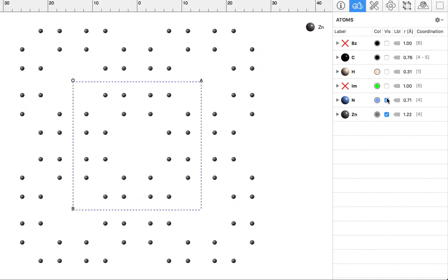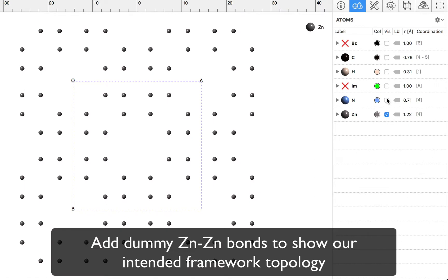Let's hide the nitrogen, and now I'm just looking at the zinc. What sometimes helps is to generate dummy bonds between certain atoms in the structure, which allows you to elucidate the underlying framework topology. Let's illustrate what I mean.